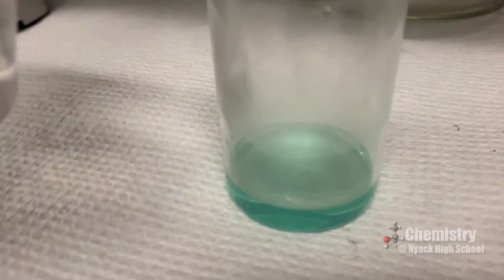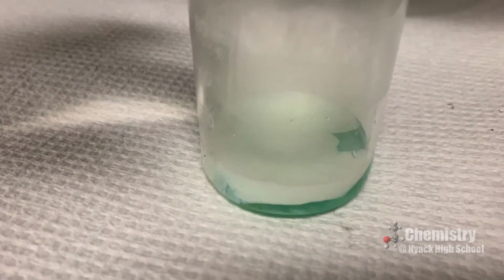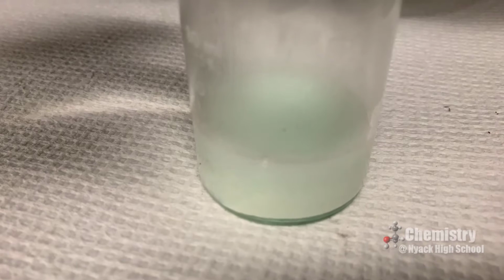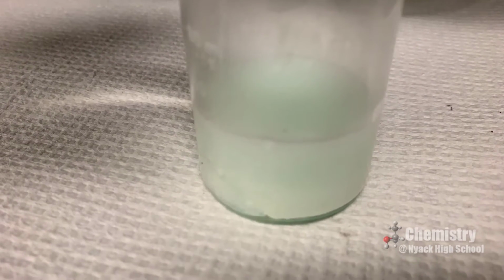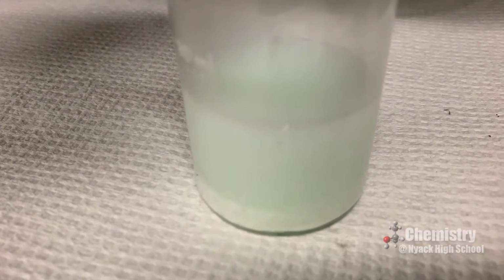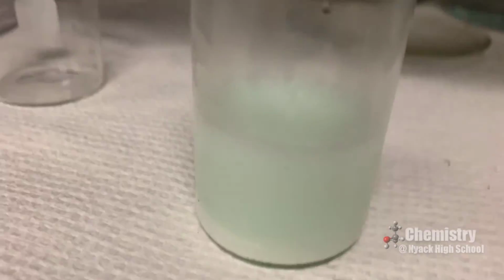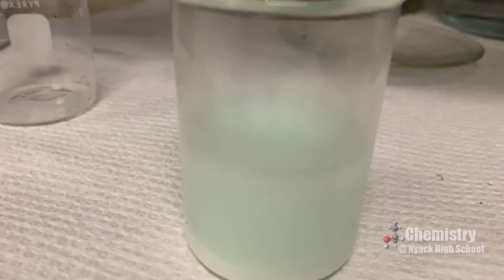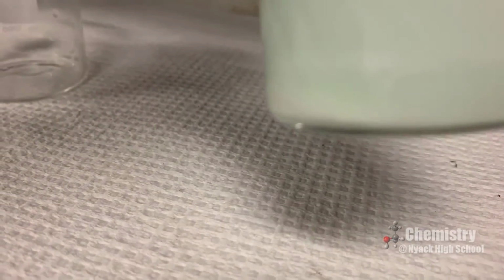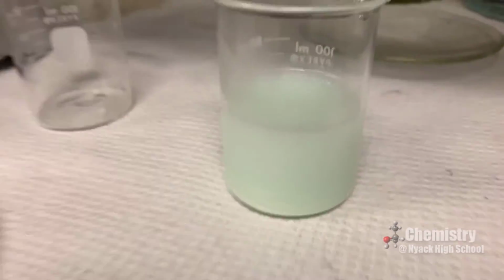So now I precipitate the silver chloride. Note that the solution turns a milky white. That is the appearance of the silver chloride, excuse me, the silver chloride solid. So I'm going to just let that sit a little while, and then I'm going to collect the precipitated silver chloride using vacuum filtration as before.